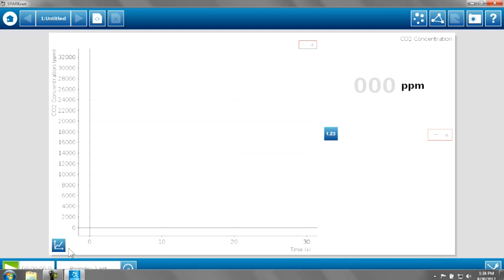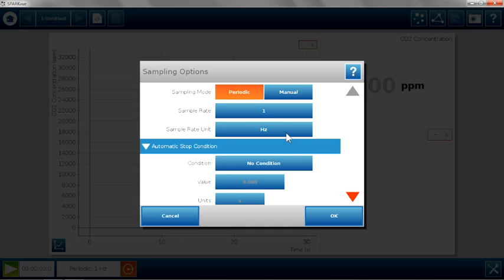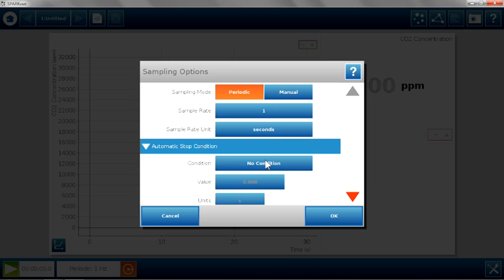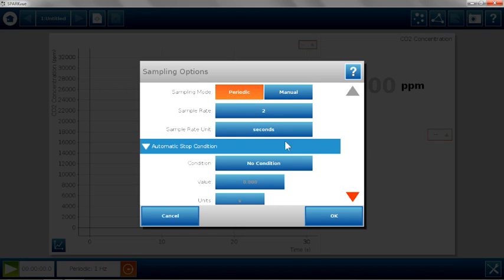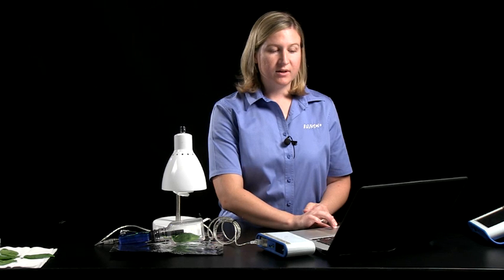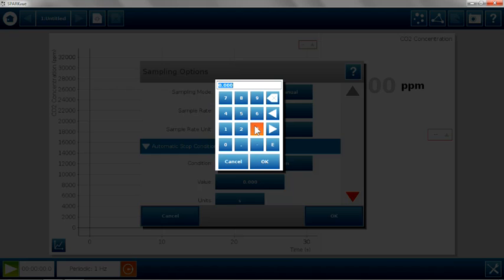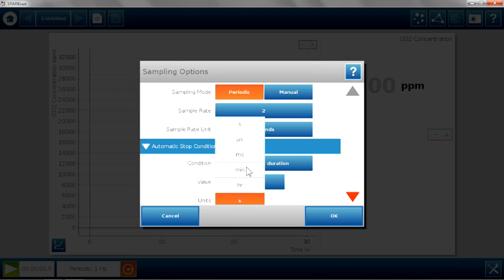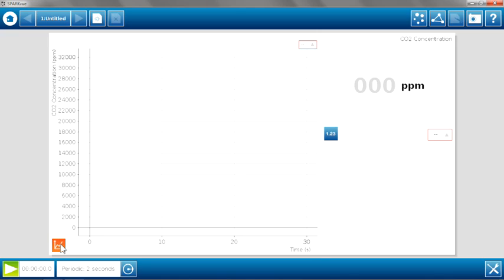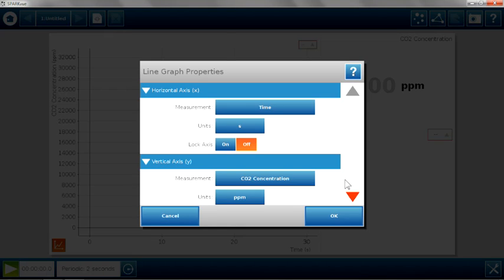For this lab, it will take five to ten minutes to collect data. So I'm going to change the sample rate. Right now it's one hertz. I'm going to change that to seconds, and I'm going to have it collect data every two seconds. If you'd like to have the data collection stop at an automatic time, you can set a stop time, say three minutes. Now I'm also going to change my x-axis to read time in minutes instead of seconds. So I'm going to open up my graph tools and change the time to minutes instead of seconds.